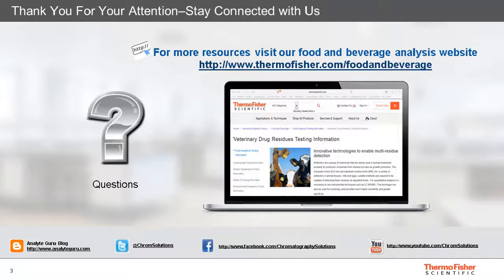The system contains an electrolytic eluent generator, which means that you only have to add water, and the cartridge which contains potassium ions will be calibrated to produce the gradient. So all you need to do in this case is to change the water on a regular basis. So we would recommend that you exchange all of the water after 2 days of use.